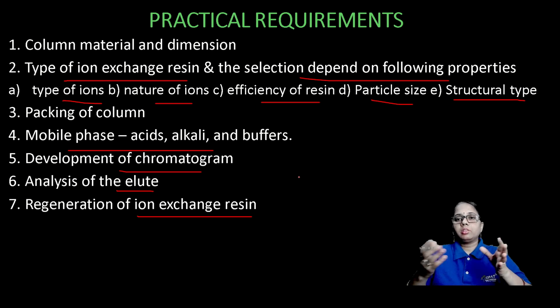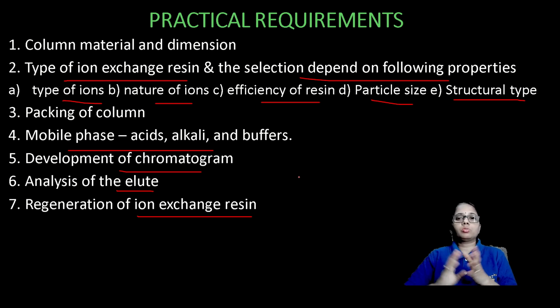You might have seen in your household how these RO water systems are used, and how frequently they are maintained, because in our water purification system also the main principle involved is reverse osmosis. The ion exchange takes place. All the ions are removed by these exchange resinous materials only. So the column beds are also disturbed throughout the passage of all those ions. So regeneration of the resins is also very important.